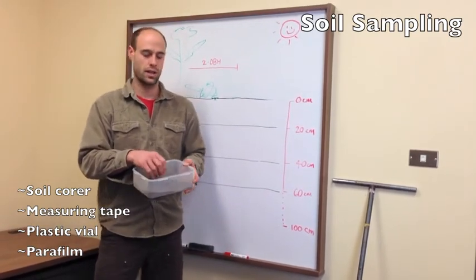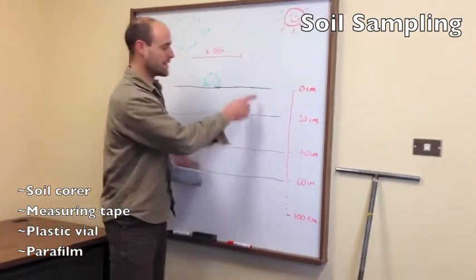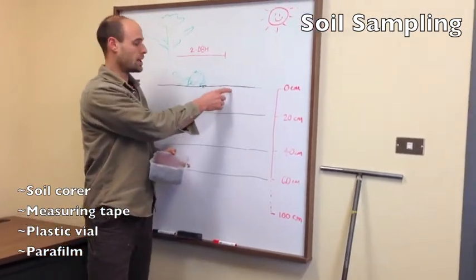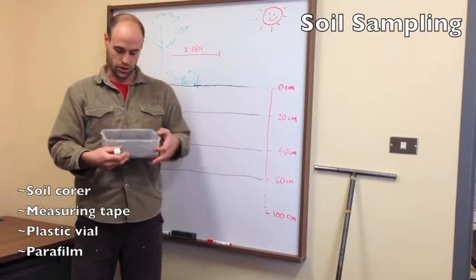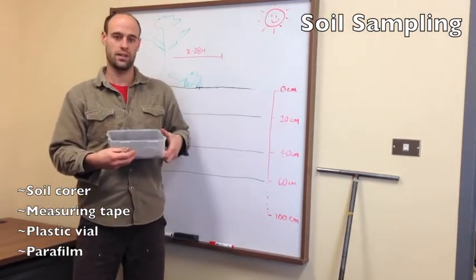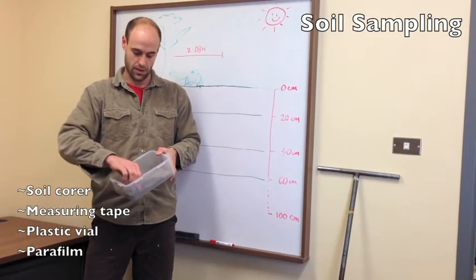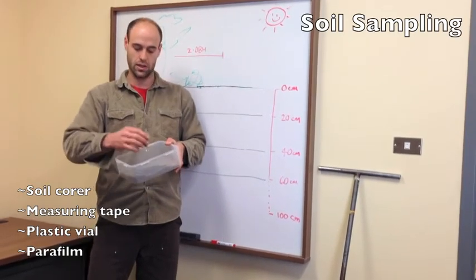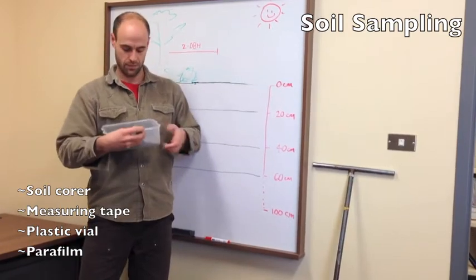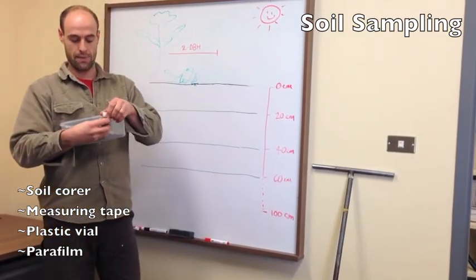What we're trying to do here is to be able to take a soil sample that represents that entire 20 centimeter interval. So with the soil well mixed, grab your vial and scoop up, fill up your vial with the necessary amount of soil so that there's no head space. It's completely full. Get the cap on there.